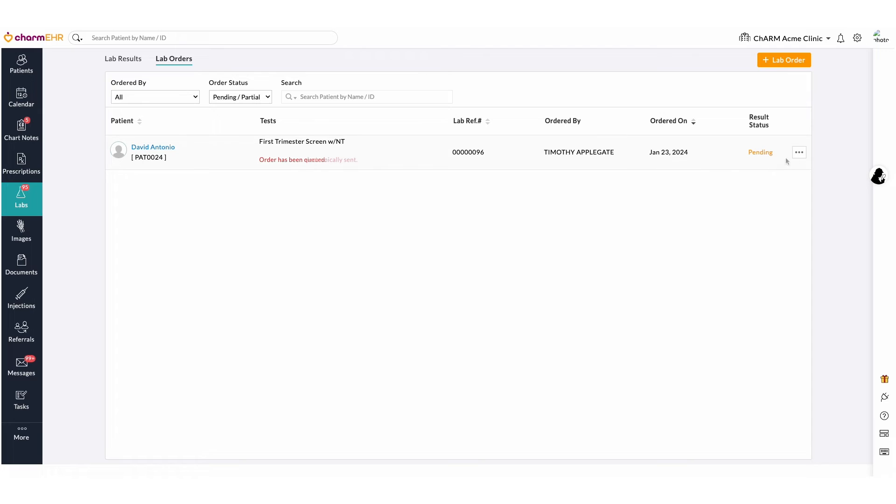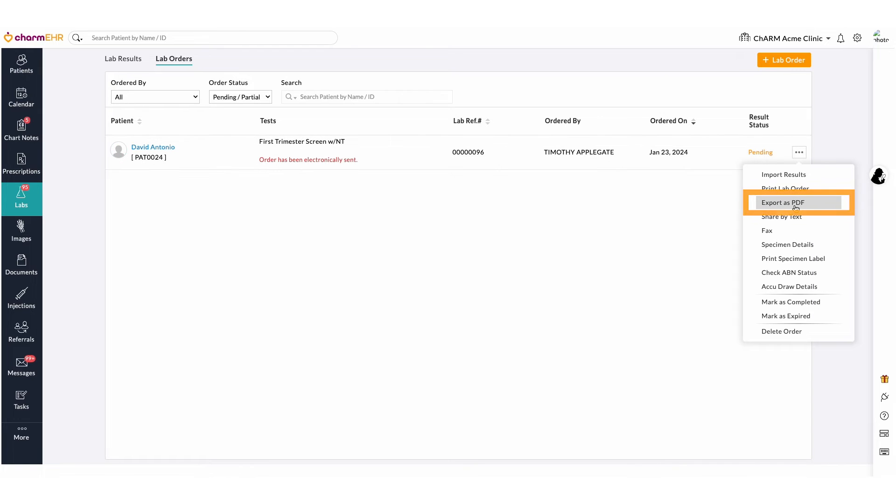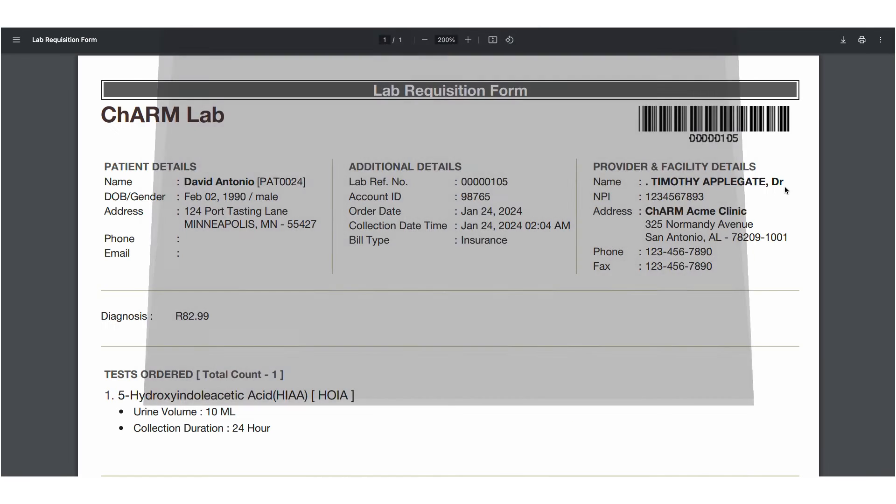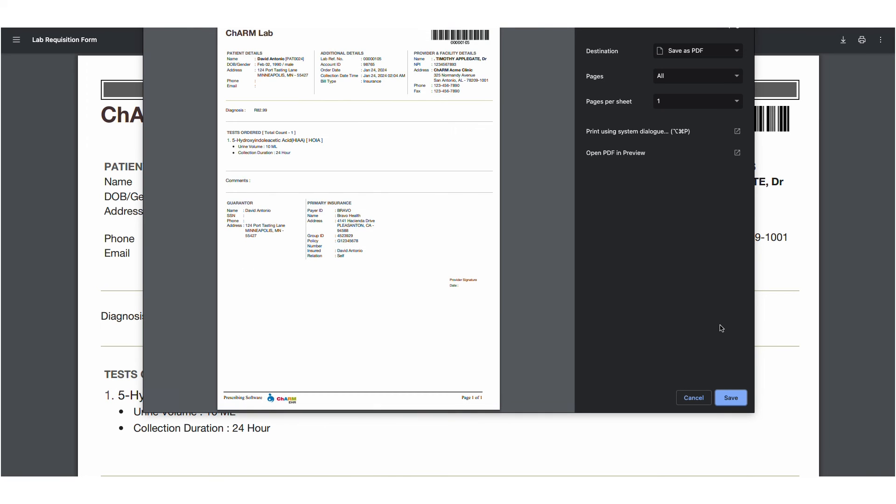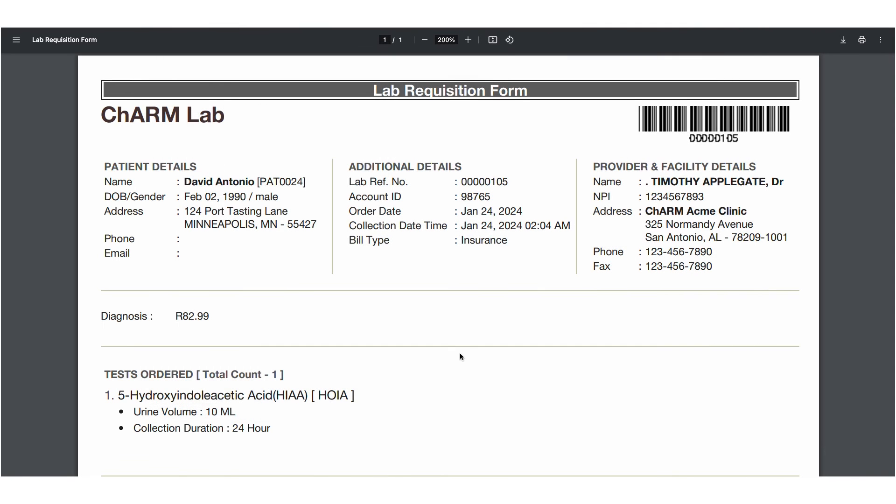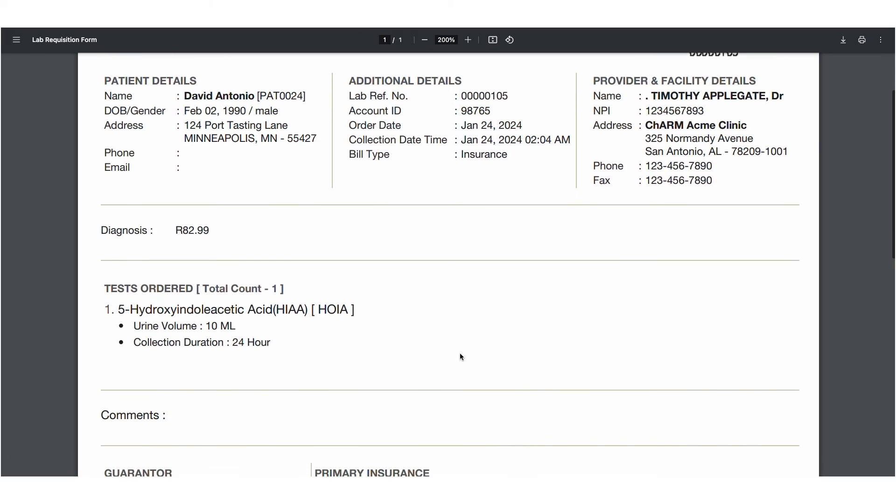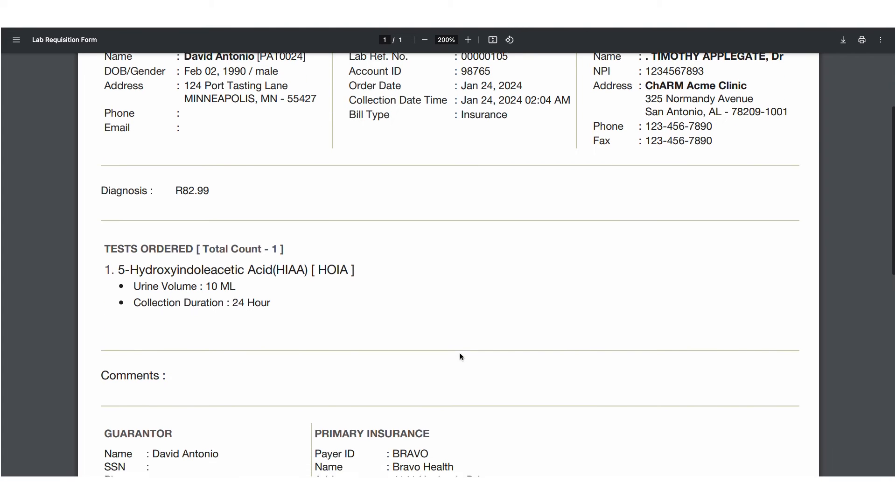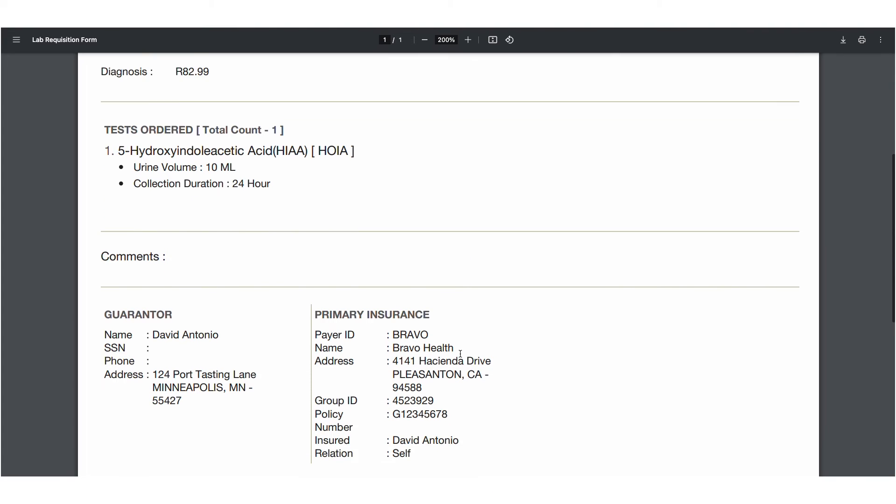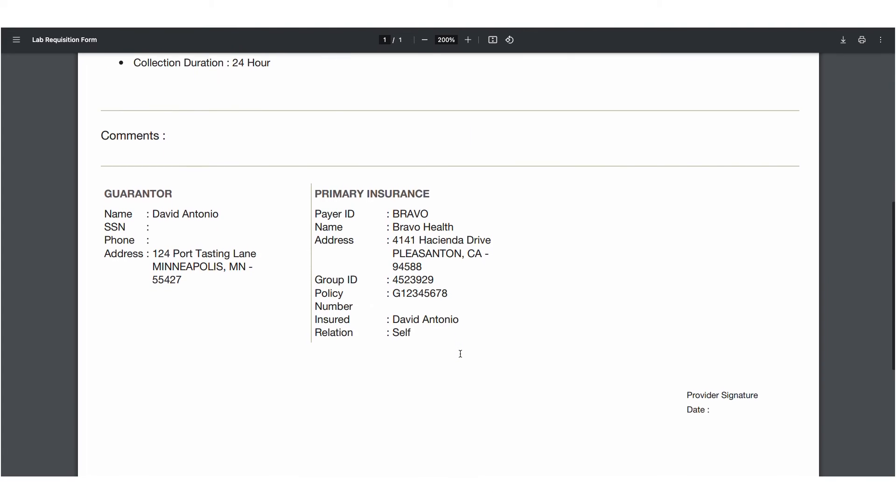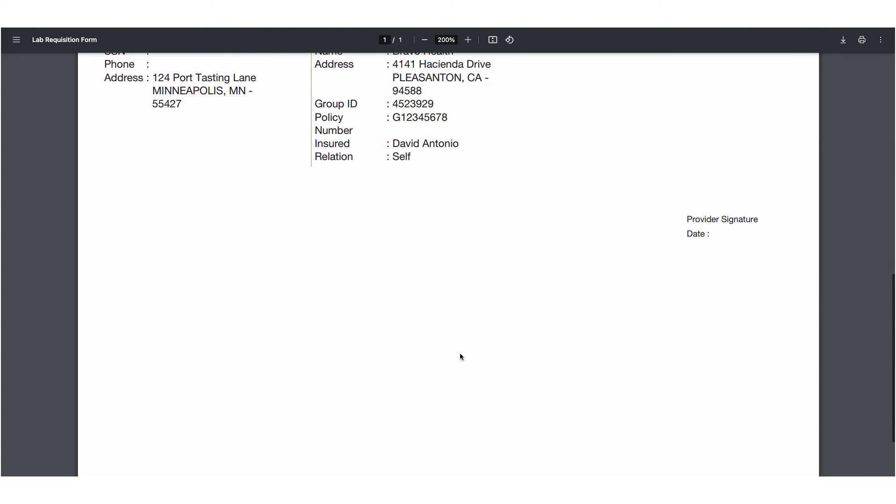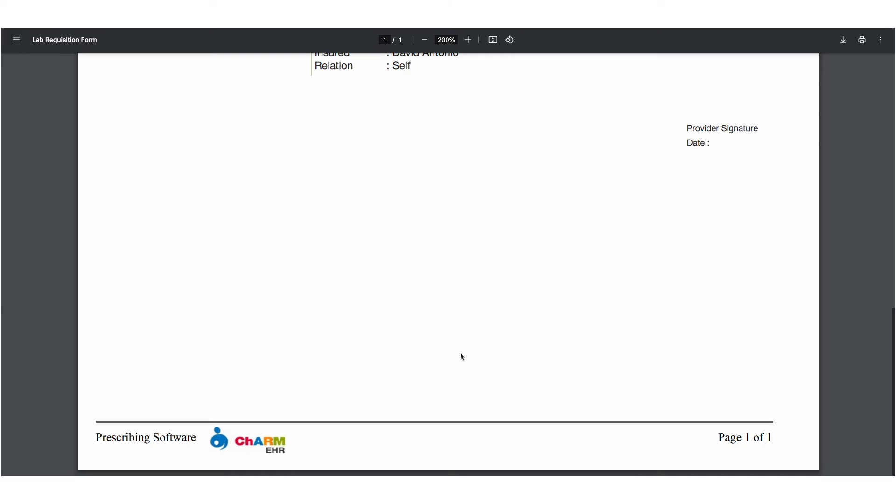The Export to PDF option is used to download the lab orders. The Lab Order copy contains complete details of the test ordered, AOE, diagnosis details, billing details, and LabCorp specific barcodes.